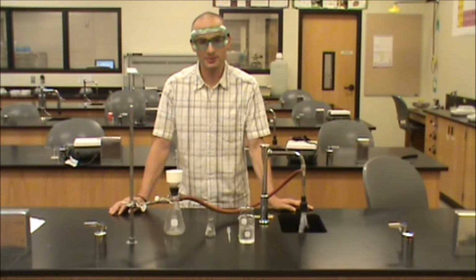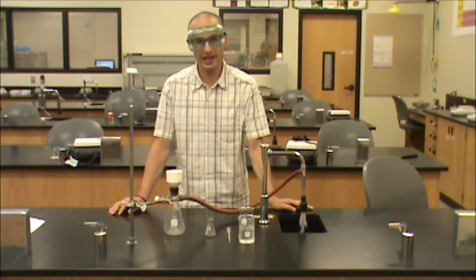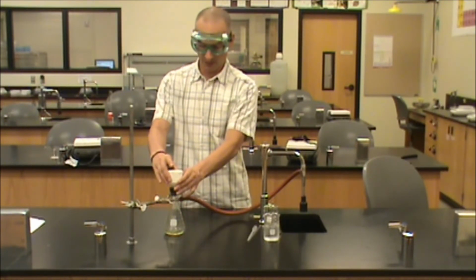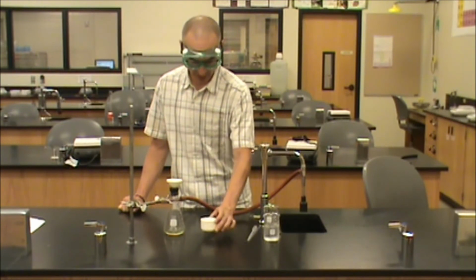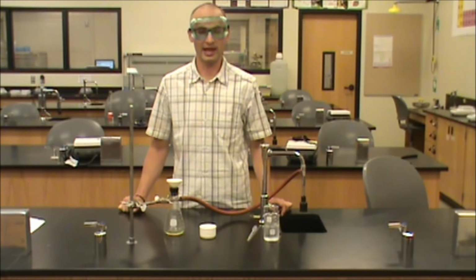We're now going to let the vacuum run for a few minutes until the crystals have begun to air dry. After a couple of minutes of running the aspirator, your crystal should now be somewhat dry. We can remove the top of the Buchner funnel, and it can be stored in your drawer for a few days in order for the drying process to complete. After the drying process is completed, we can test the crystals for purity using the melting point apparatus in the instrument room.